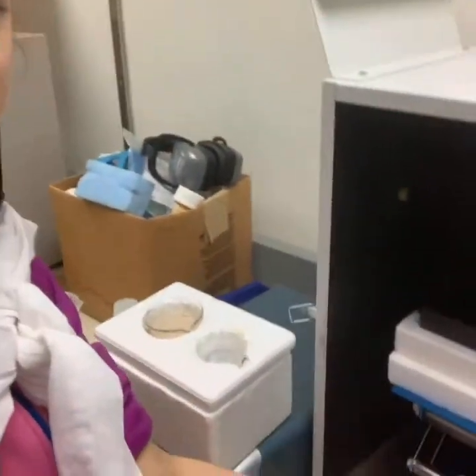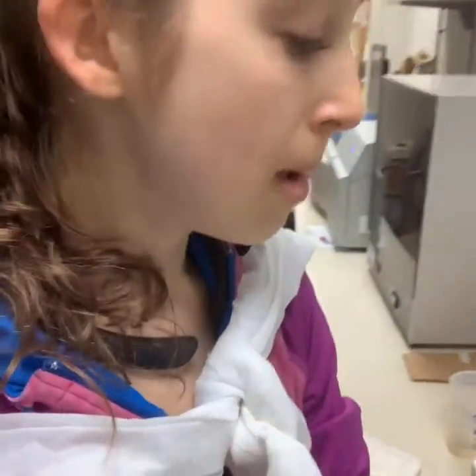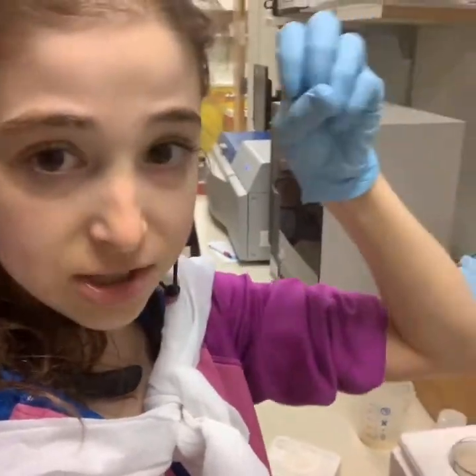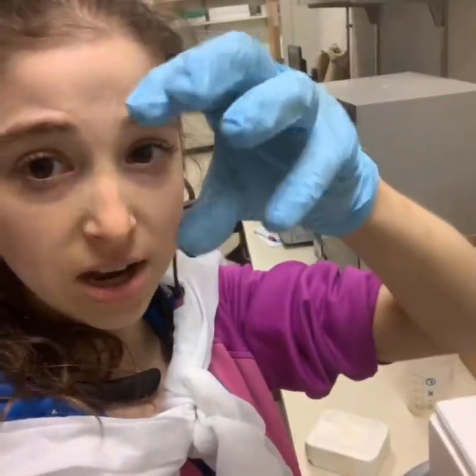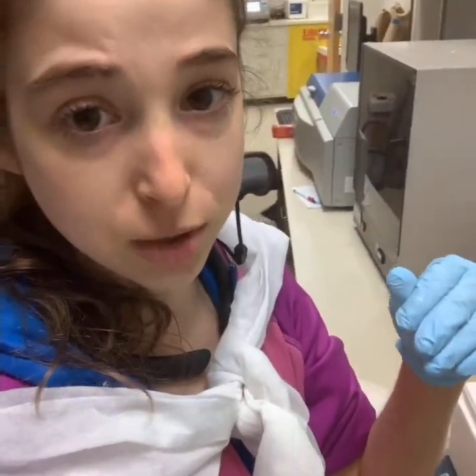There's a little stand that doesn't go to the right height, so we have some styrofoam blocks on top. What I'm going to do is hook it up and put the probe inside, and then set it to go in bursts — like two seconds on, four seconds off — and it just keeps going. I do several cycles of that. So that's the probe sonicator.